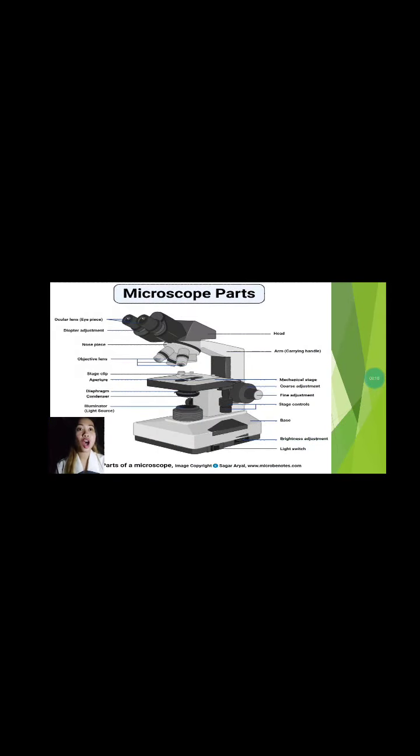So, these are the microscope parts. Daghan mang type ang microscope na siya'y simple, compound. So, ang akong gipakita karon nga parts and functions is parts and functions siya sa compound microscope. So, these are its parts.